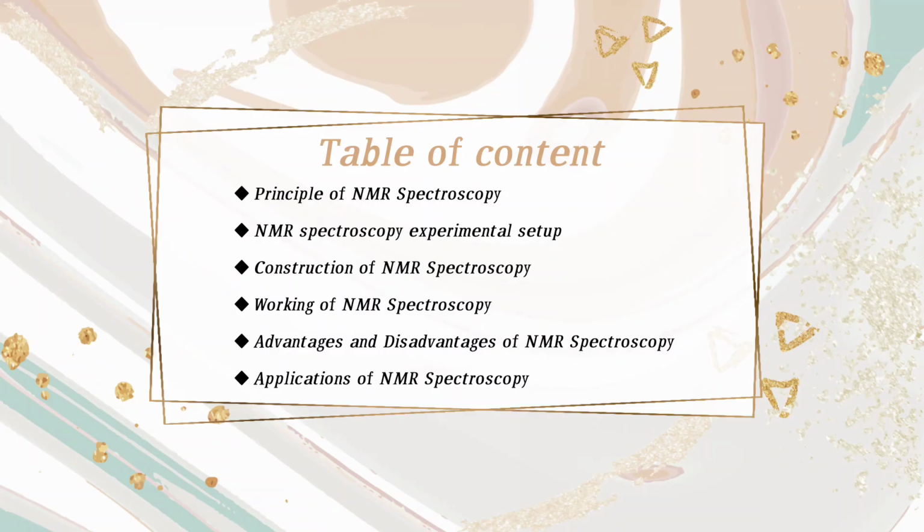Table of contents. Principle of nuclear magnetic resonance spectroscopy, experimental setup, construction of nuclear magnetic resonance spectroscopy, working of nuclear magnetic resonance spectroscopy, advantages and disadvantages of nuclear magnetic resonance spectroscopy, application of NMR spectroscopy.